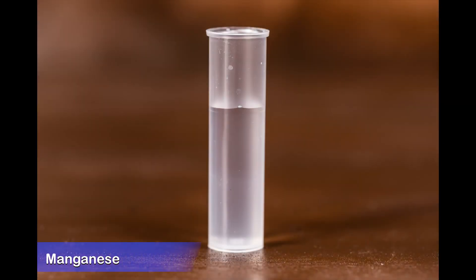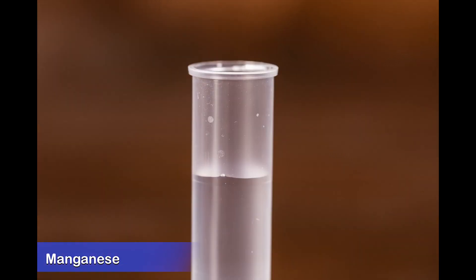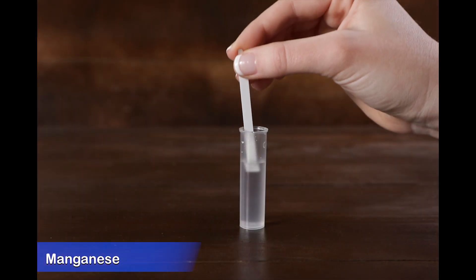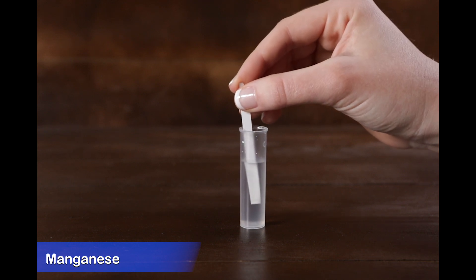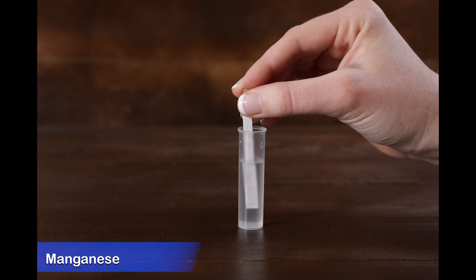The manganese test uses the large semi-clear vial. Fill the vial to the top line with water. Dip manganese strip number one into the vial for 20 seconds using a constant back and forth motion. Discard the strip.